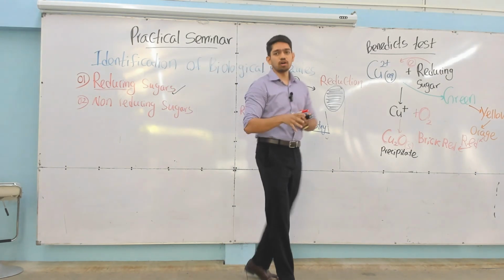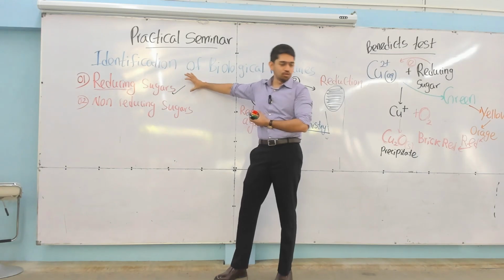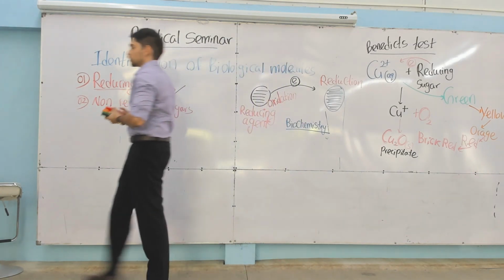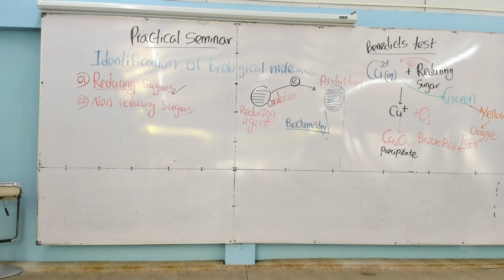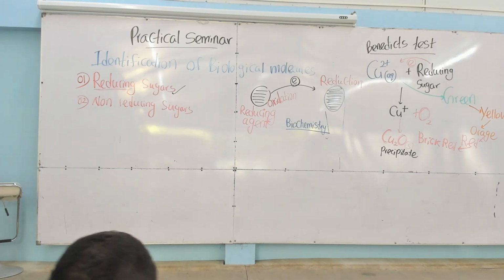Then for today, if we are doing the reducing sugar test, I'm just going to take some glucose powder and make a solution and do the practical. What do you think we are given in that exam to do this test? To test for sugars and proteins, bile salts, or what do you think? Urine, okay? Online people, what do you have to test for in a biochemistry exam? Yeah, urine. So how do you get urine? How do you get urine? Someone has to donate it, right?